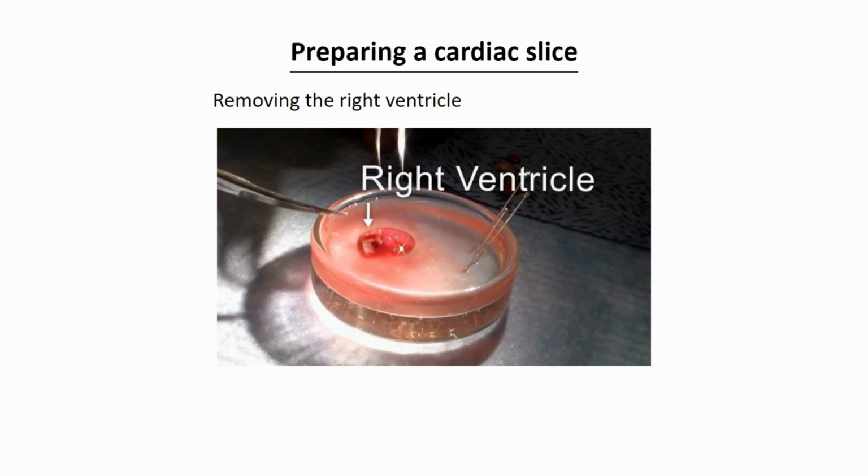And the opening of the right ventricle is a crescent-shaped opening that is pointed to right here. And you'll see a little bit better in the video how that arises. While the opening of the left ventricle is the round opening that you see right here. So now we'll show this video of removing the right ventricle, and this video will take about 1 minute.